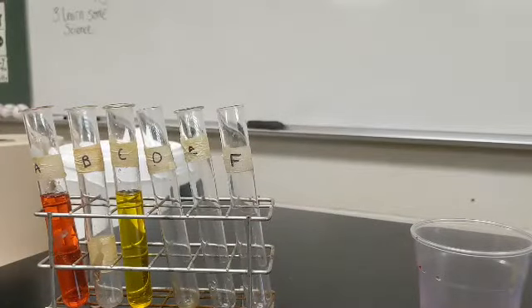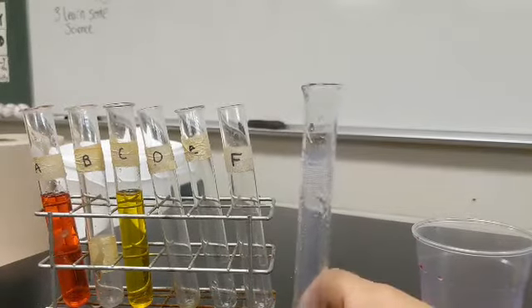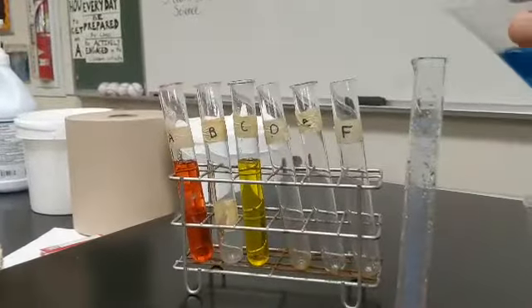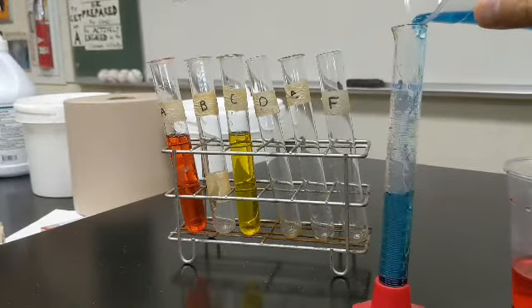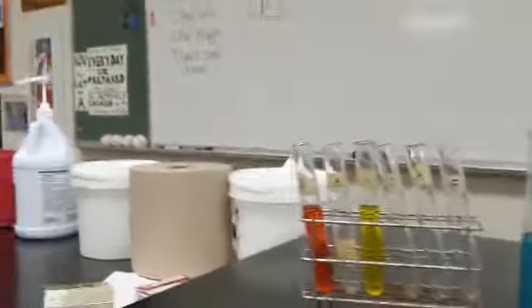Step 3, into test tube E, add 18 milliliters of blue water. Let's see how we did.